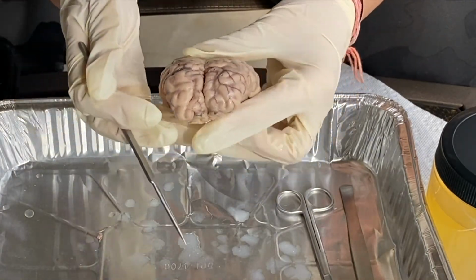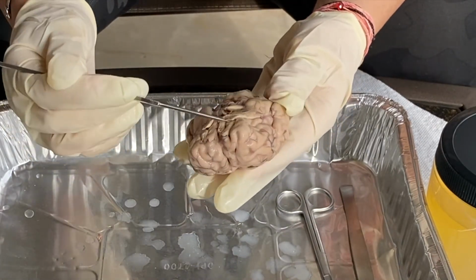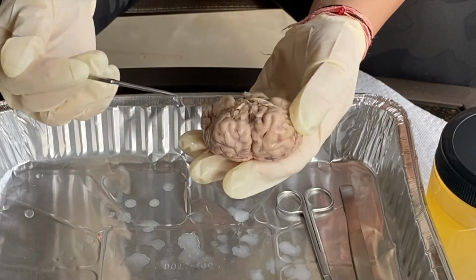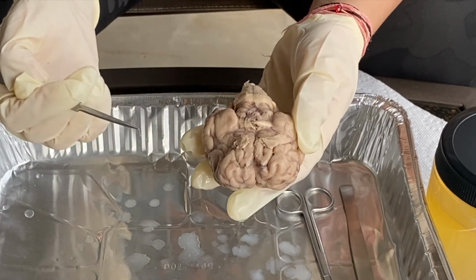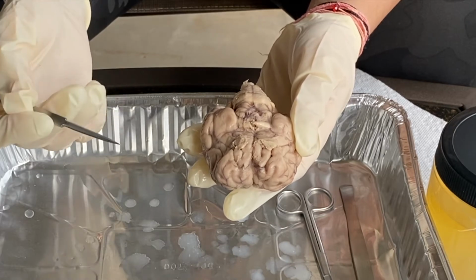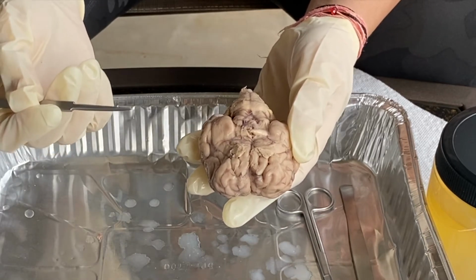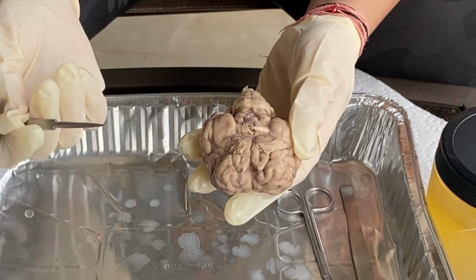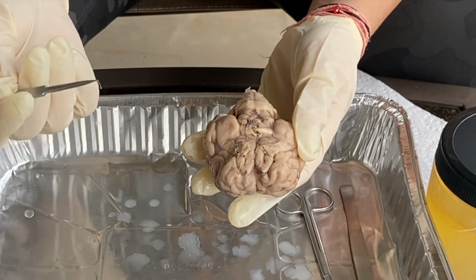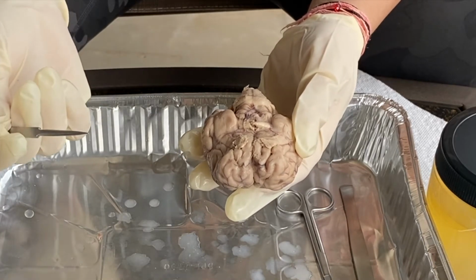Then we have our olfactory bulb right here, I believe, and that is basically what receives the neural input about odors that are detected by cells in the nasal cavity. The axons of olfactory receptors, which are basically the smell receptors, extend directly into the olfactory bulb where the information about odors is processed.